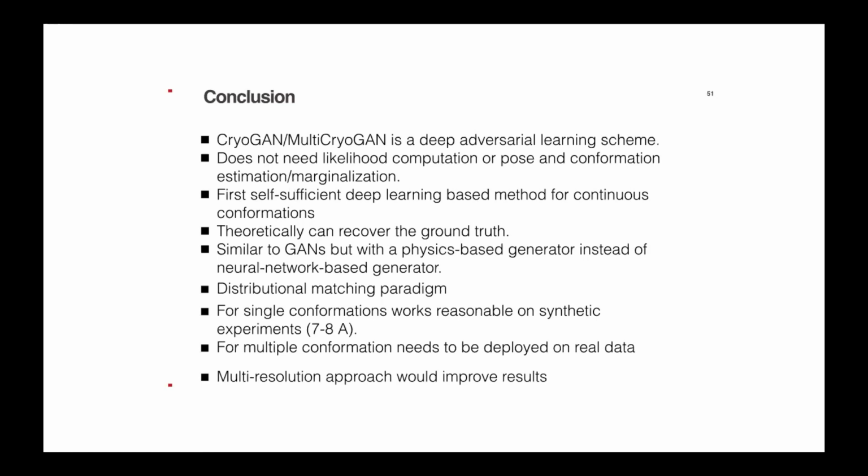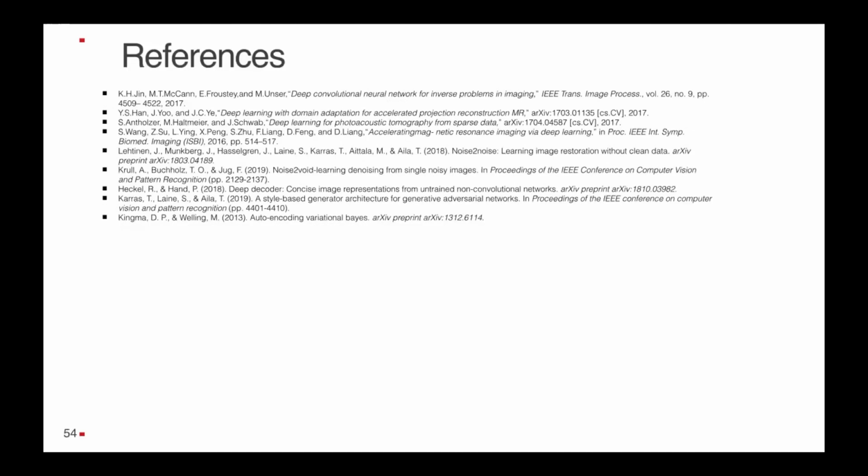And just like GANs, where a phase transition happened with multi-resolution approaches like StyleGAN or Progressive GAN, at one point they were not able to generate face data sets and the results were really blurry. Then came the current status of GANs, where they can generate faces that look really like real faces, and this came from multi-resolution. So we hope that a multi-resolution approach or techniques along those lines can help us get 3D reconstructions whose predictions look really like the real data, and which can actually help us with the resolution. So these are the references, and yeah.